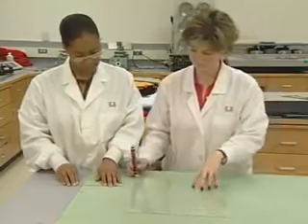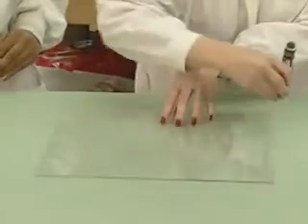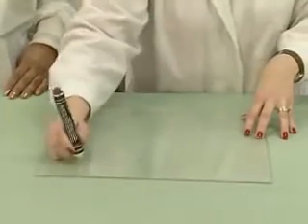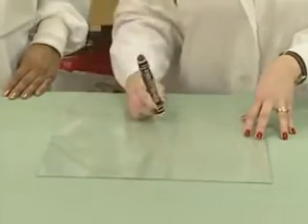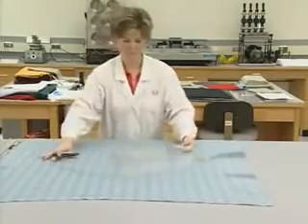Place the 15 by 15-inch square template on the fabric. Align the template's straight edges parallel to the selvages or width edges of the fabric and to the top and bottom edges of the sample. Make sure that the edges of the template are more than 10% from the edges of the sample's dimensions. Mark the outside edges of the template. A total of 3 specimens should be marked if enough fabric is available.